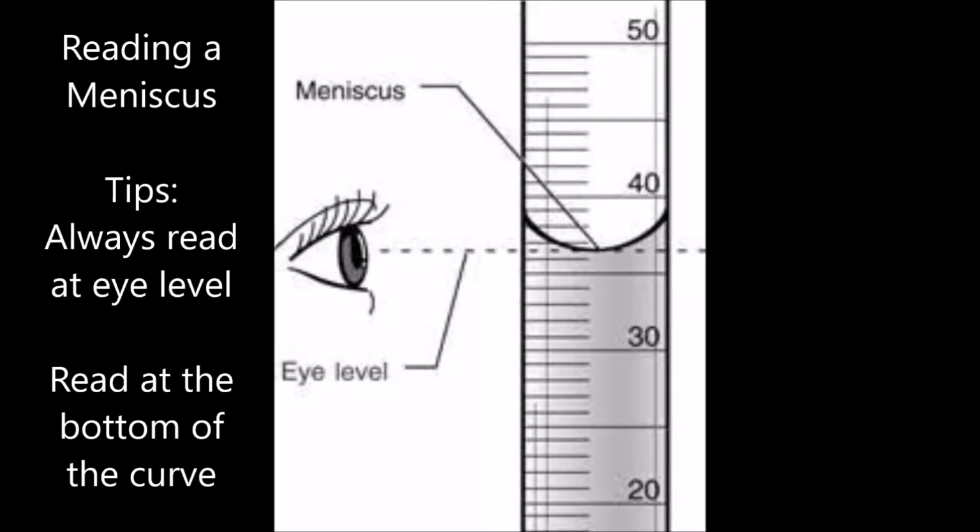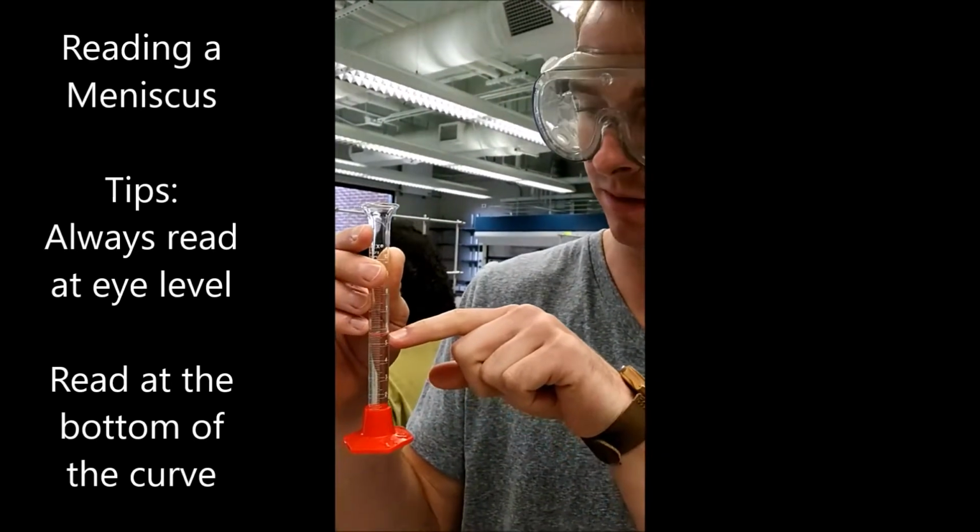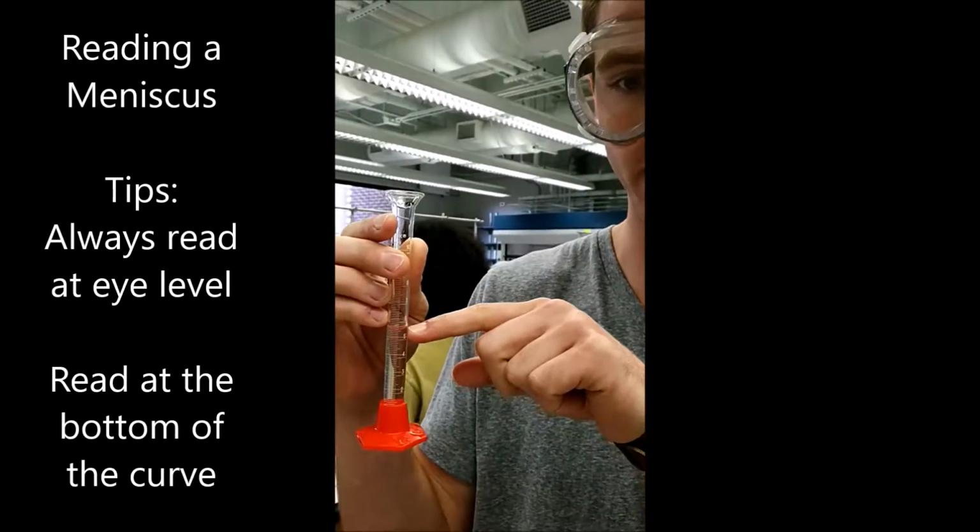Since this lab deals a lot with measuring liquids, it is important to review how to correctly read and record volume, as well as why a meniscus forms. A meniscus, as shown on screen, occurs when the molecules of the liquid are attracted to those of the container. When reading the volume of the liquid, always read at the bottom of the meniscus and record that.